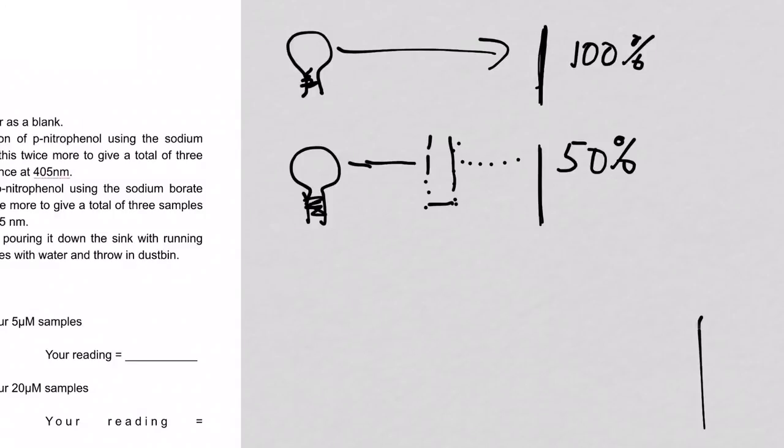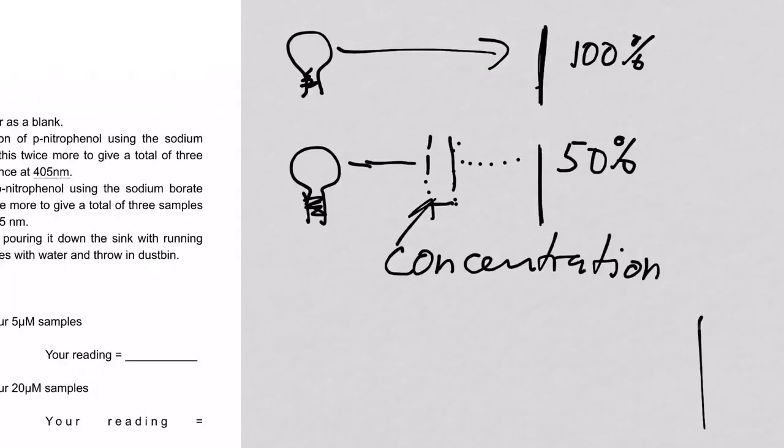And how much this has darkened the photodetector depends on the concentration in this thing in here.